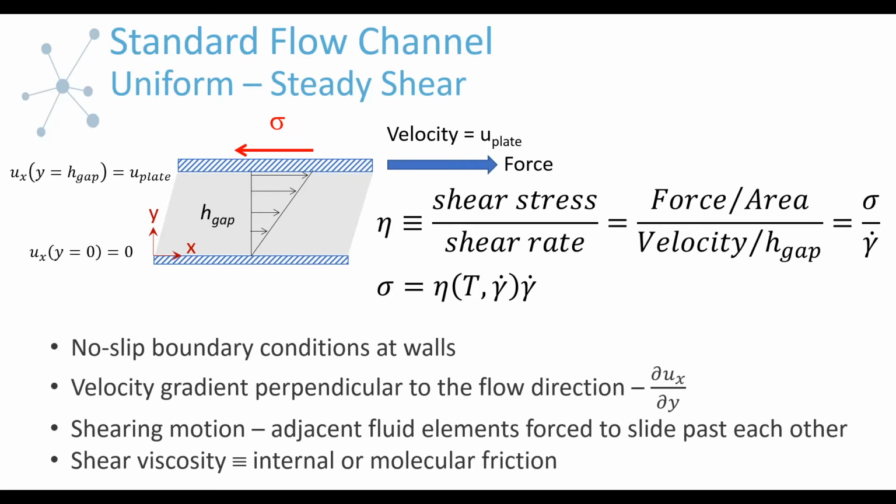It's going to be a different experience for, for example, low molecular weight solvents, for the fluid elements to slide across each other, versus say a solution of macromolecules where you have very high molecular weight polymers or proteins. And also for systems like that, if molecular weight gets large enough, you can even have a velocity gradient across the molecule.